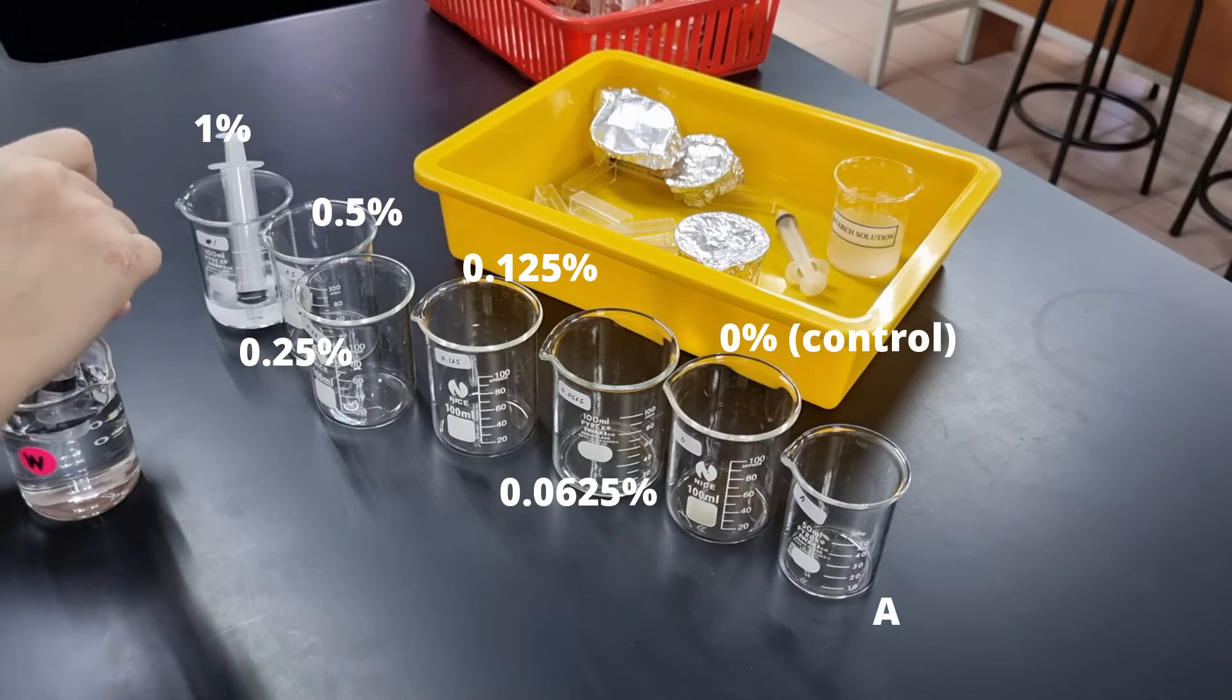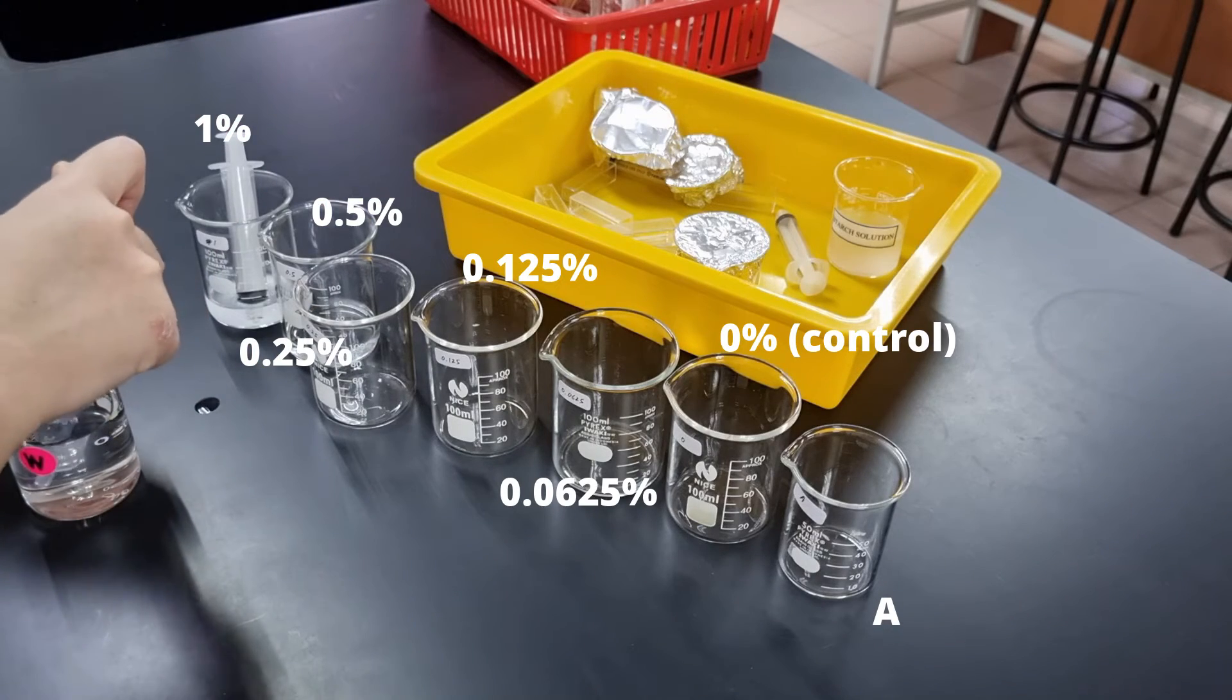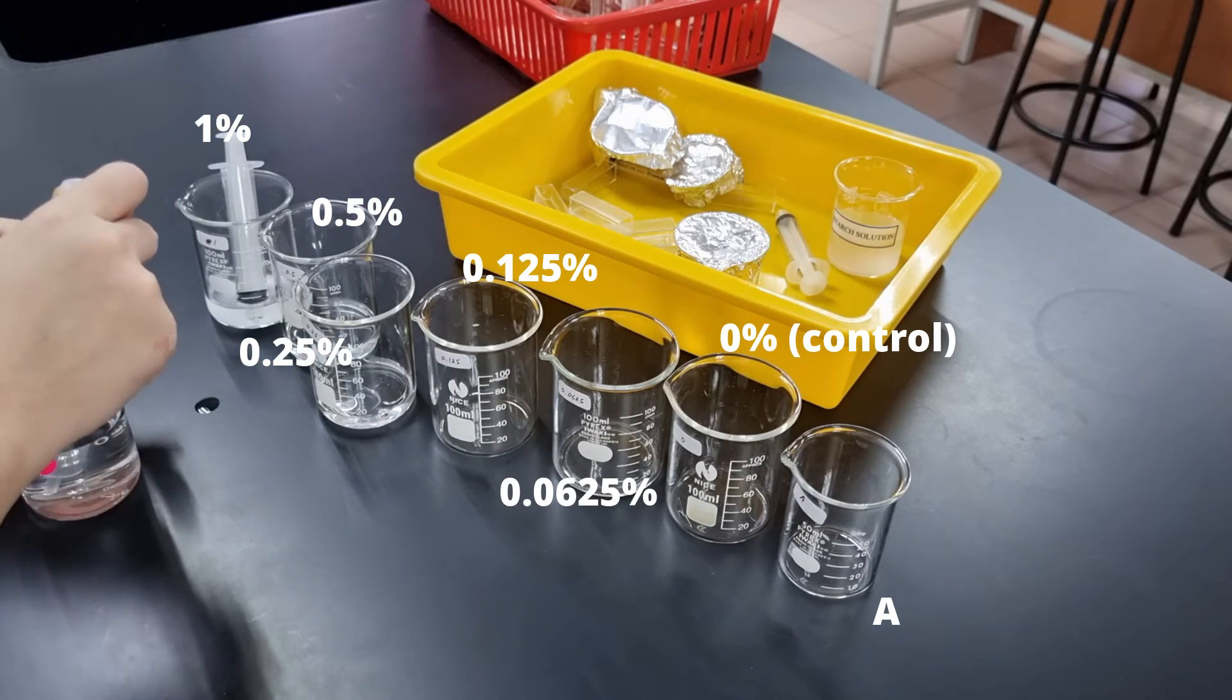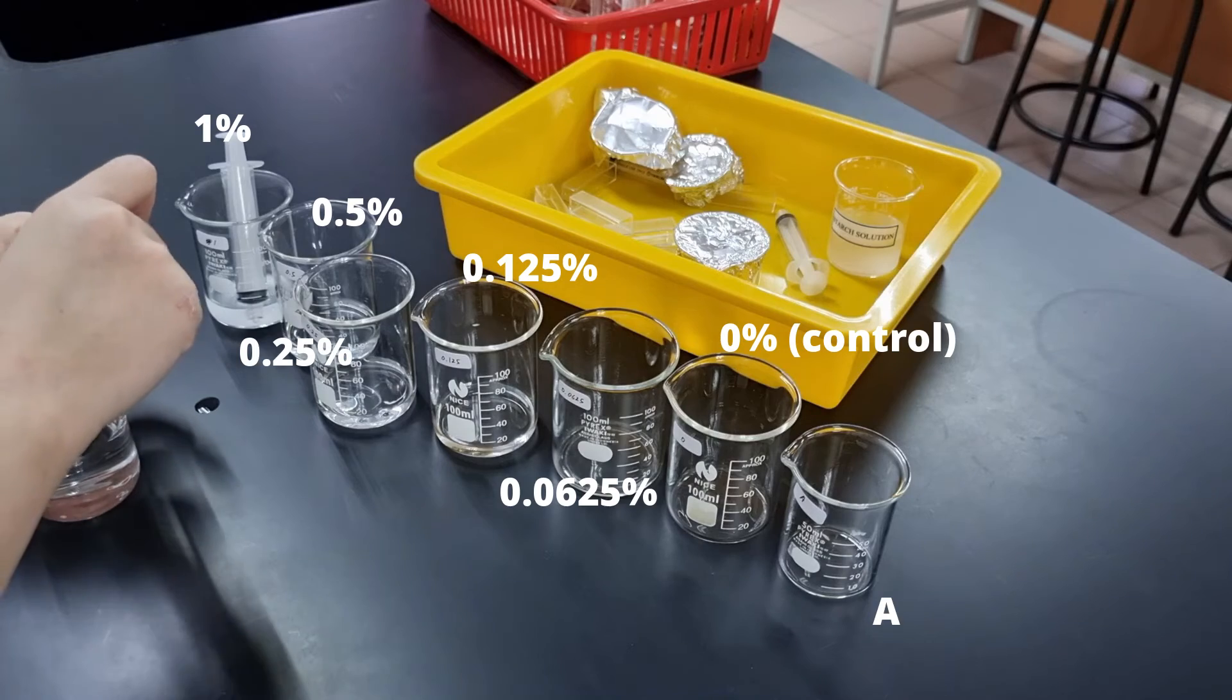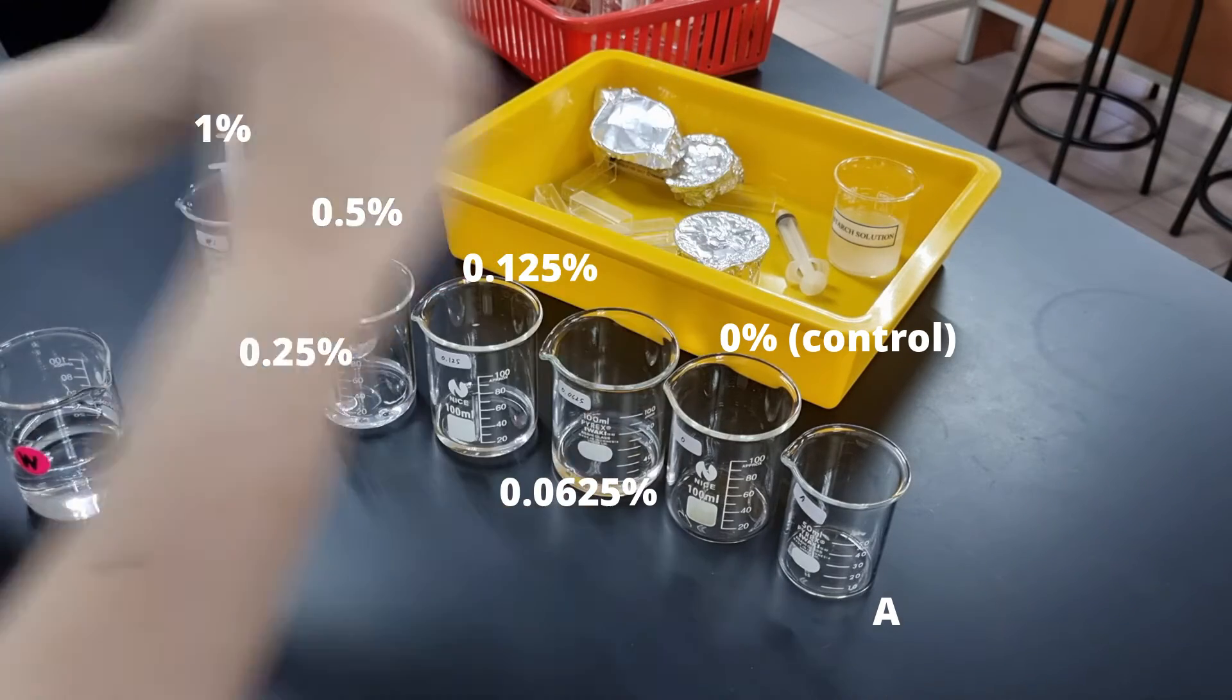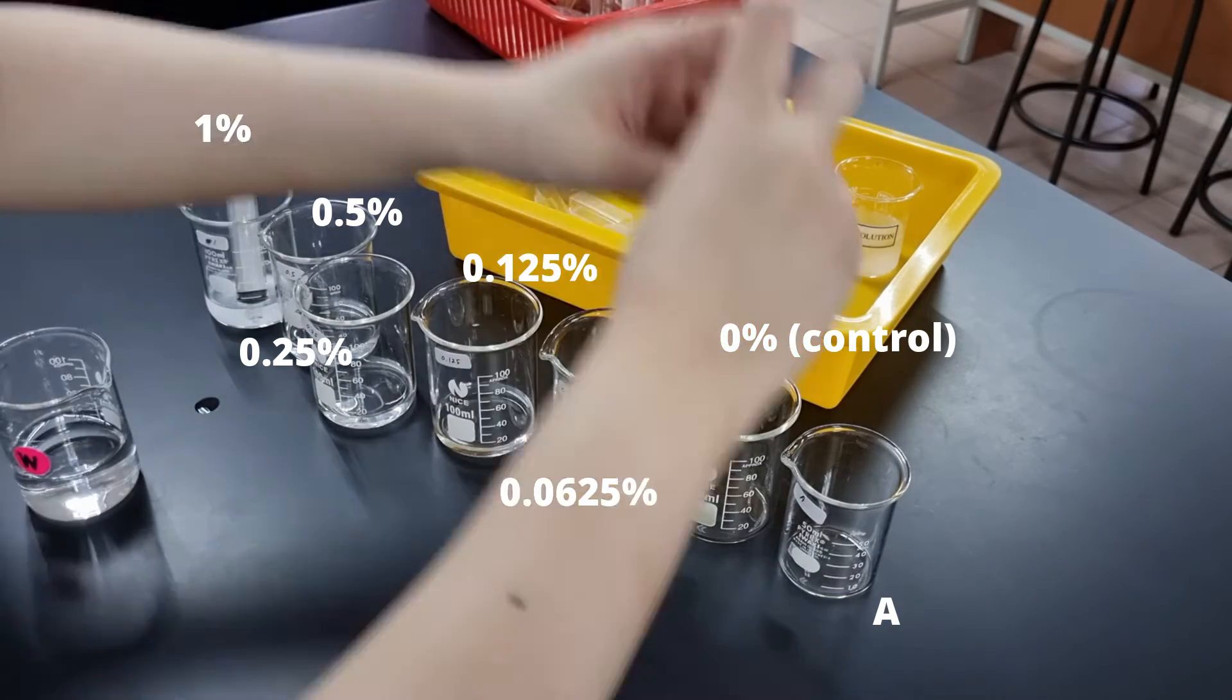Pro tip, with serial dilutions, since the volume of water used in each beaker is the same, which is 10 cm³, I am adding 10 cm³ of water to each beaker first for each concentration, and then only transferring the solutions from one beaker to the other.